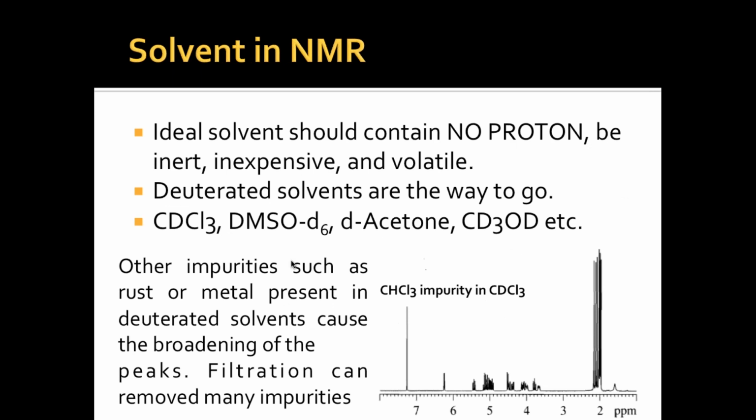Now, see one thing. Nuclear magnetic resonance, NMR: basically, we do NMR for the proton and for the carbon, right? But every molecule has hydrogen and carbon. So how to do NMR if every molecule will show up in the NMR?